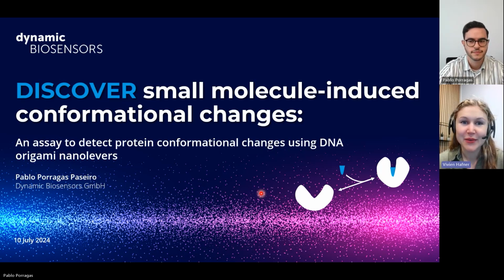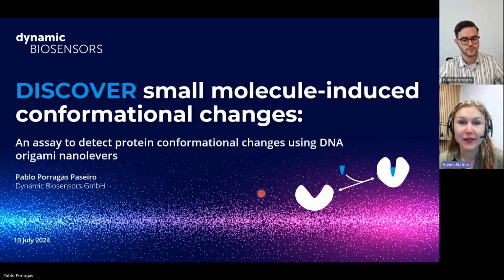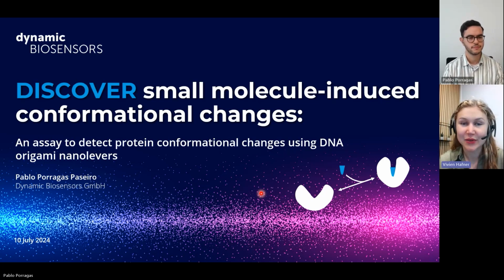So each month we look at a different molecular interaction and we discuss assays, how to characterize them, and we also explore what kind of insights you can gain from biophysical assays. And in this episode, we will talk about a specific mode of action that has come increasingly to the fore, and that is influencing the conformation of a target protein.